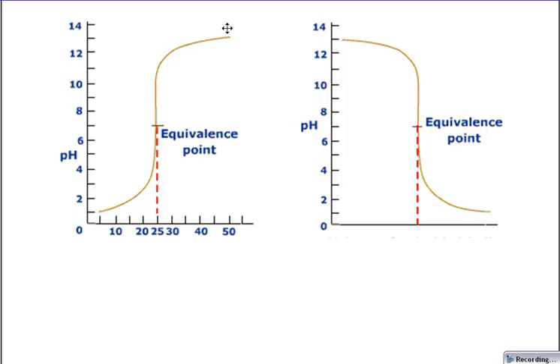And not only is it basic, it's really basic. This is pretty close to 14. So I would say that what's in our burette is a strong base.